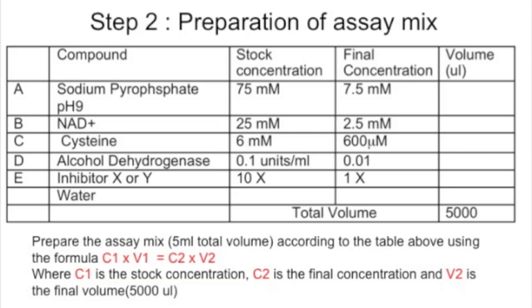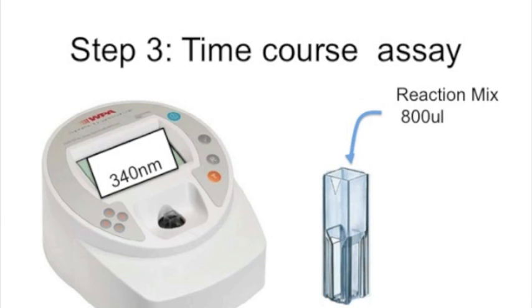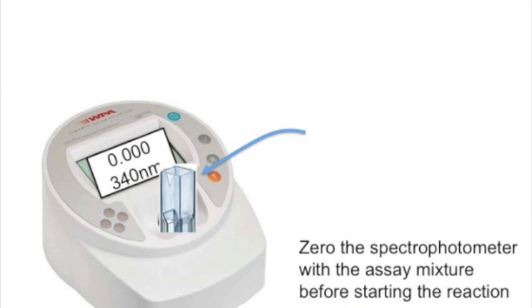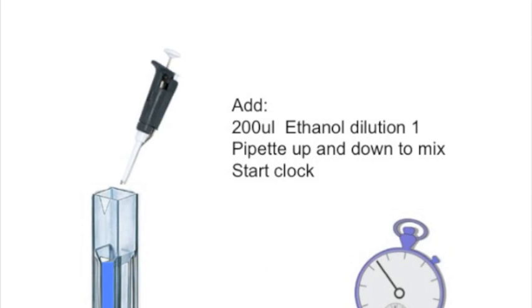Remember that you will use either inhibitor X or Y, and agree with your neighboring group to use the opposite — if you use X, they will use Y. You are now ready to start the reaction. Pipette 800 µl of the reaction mix into a cuvette, put the cuvette in the spectrophotometer, and zero it at 340 nm.